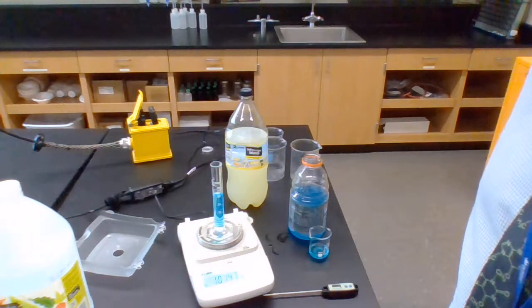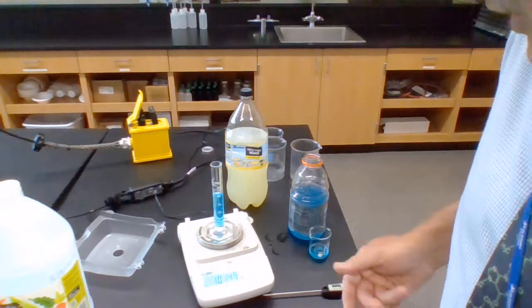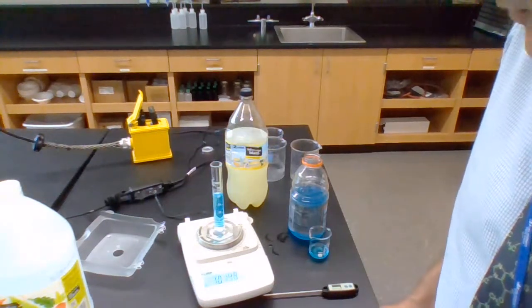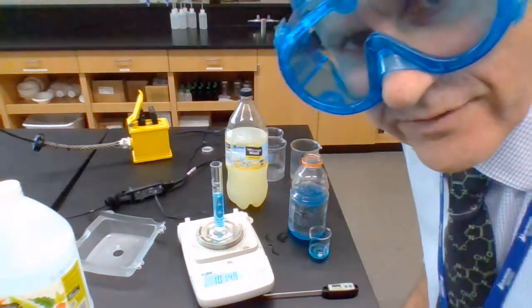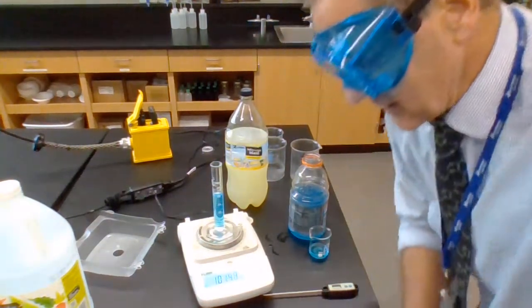So now, this one, it says 10.148. I divide that by 10, and it's 1.01489. 1.015. Okay? So, looking at this, we've got some densities.